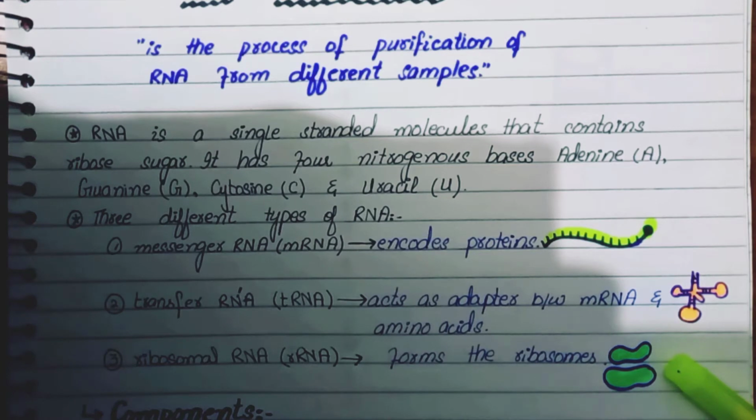As we have already mentioned, in this video I will discuss RNA extraction. So let's see what RNA extraction is. RNA extraction is basically the process of purification of RNA from different samples. These samples may be blood, tissues, hair, bacteria, viruses, bacterial cultures, etc.